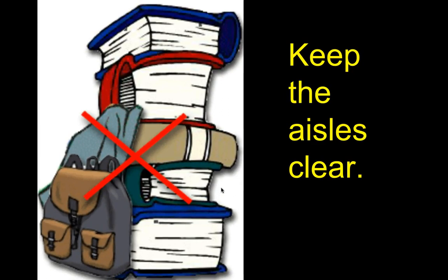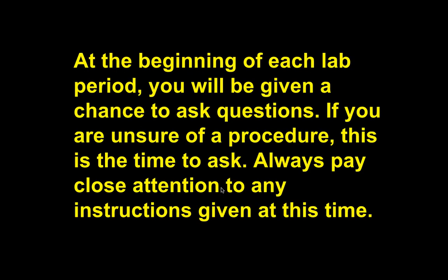First thing: keep the aisles clear. With all our desks the way they are, it's very easy for someone to trip, or if there's an emergency and we need to exit. Put your books underneath your chairs — that's what it's there for. Don't put books on the lab tables because we're going to be using those, and some tables have chemicals on them. At the beginning of each lab, I'll give you a chance to ask questions. If you're not sure, ask.